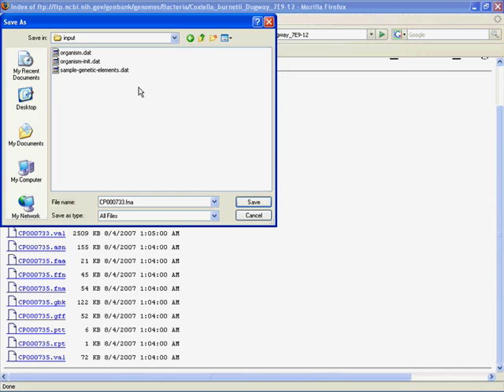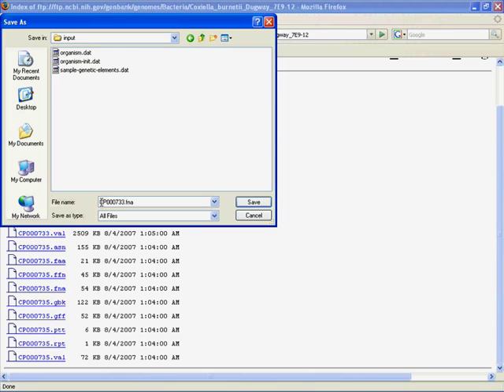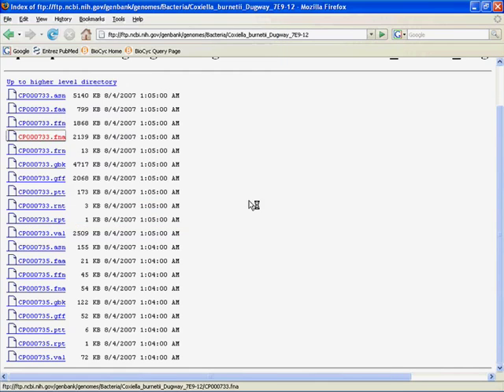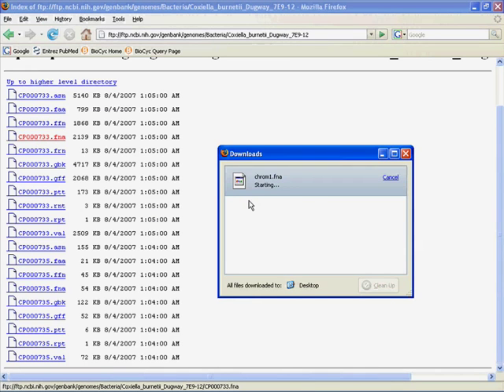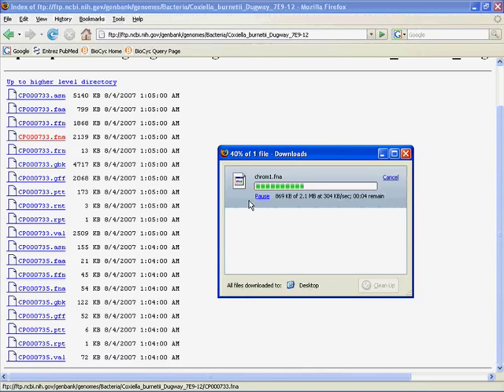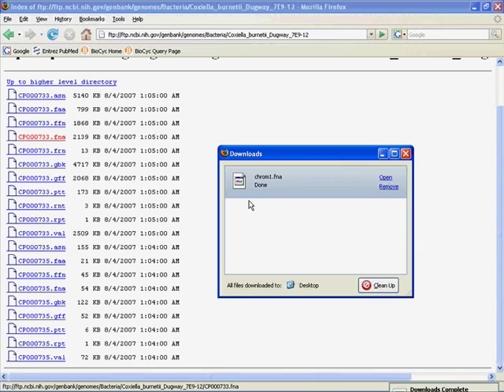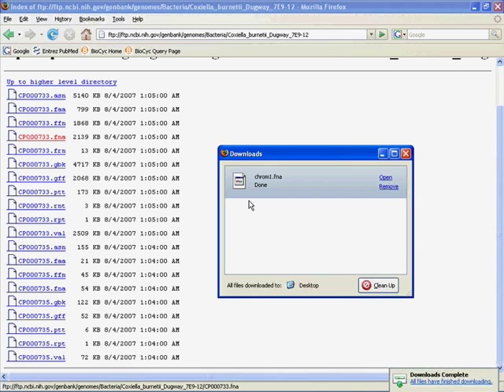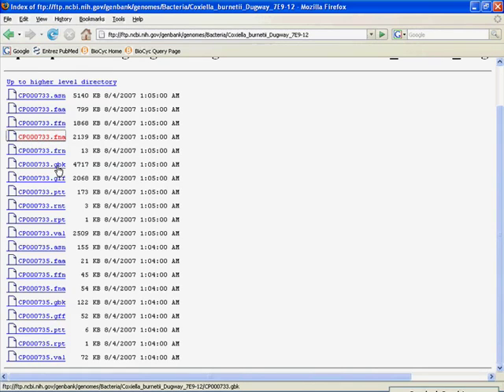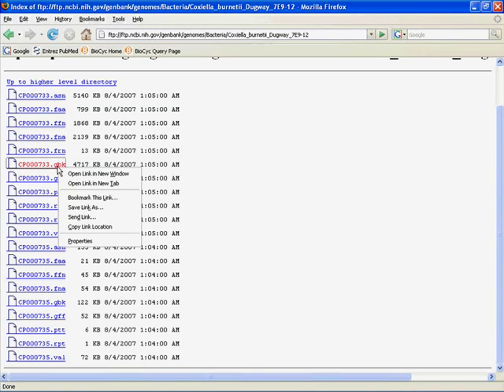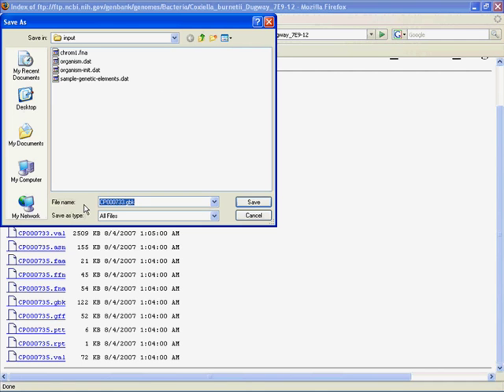Okay. Now here is the folder where we're dumping the four files that we need. You can see already in there we have an organism.dat file, an organism.init.dat. We're not going to mess with either of those. And a sample genetic elements.dat file, which we will be editing once we finish downloading all this stuff. Now you could just save this thing with its given name from NCBI, but I find that really confusing. So I recommend changing it. So we'll just call this chrome1.fna, because it is the first, and in this case only, chromosome. Okay. So we have our first FASTA file ready. Let's get the GenBank file for the genome. Again, I'm going to call it chrome1.gbk. Okay. You can see the FNA is there.